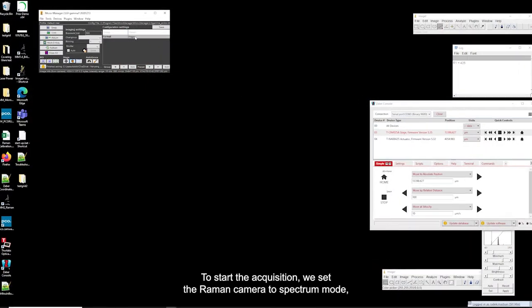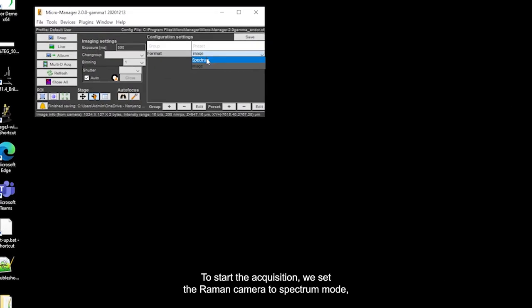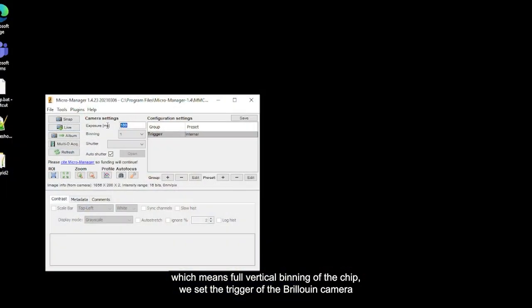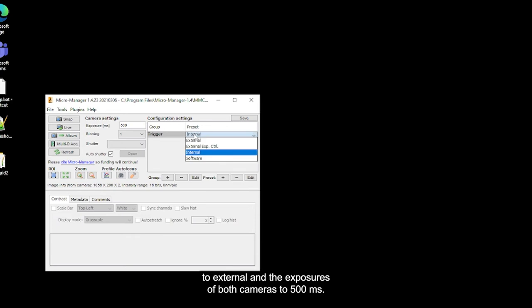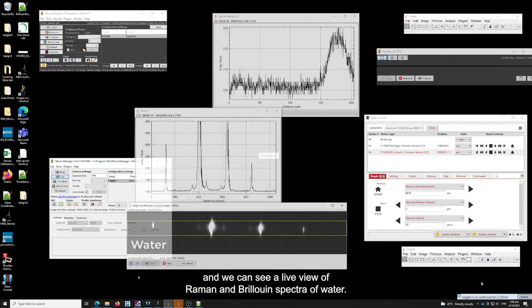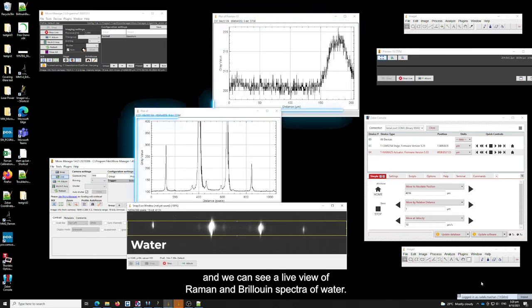To start the acquisition, we set the Raman camera to spectral mode, which means full vertical binning of the chip. We set the trigger of the Brillouin camera to external, and the exposures of both to 500 milliseconds. Then, we start the live acquisition, and we can see a live view of Raman and Brillouin spectra of water.